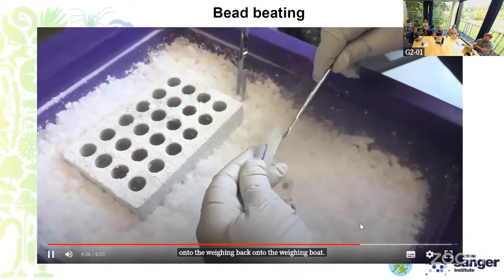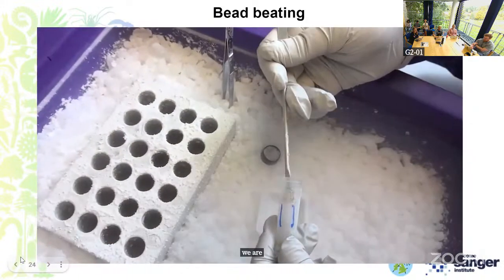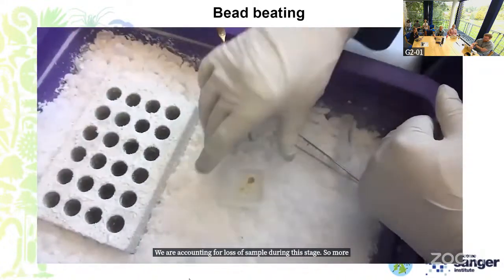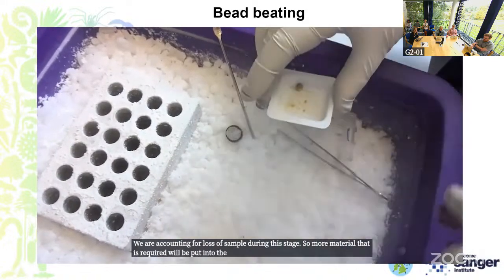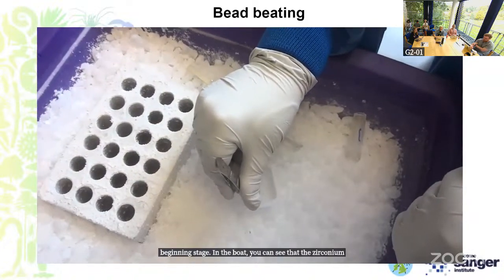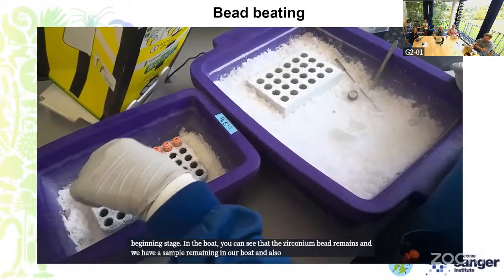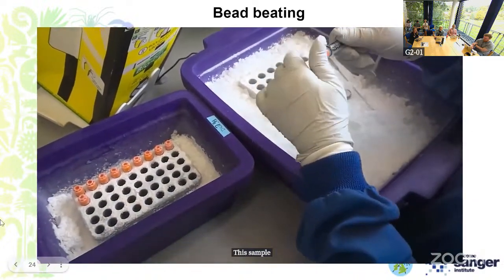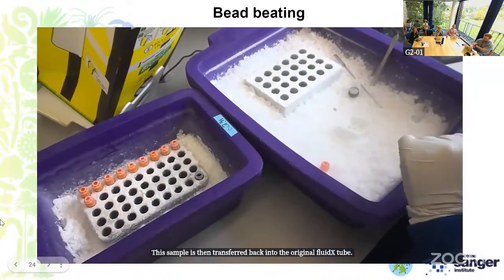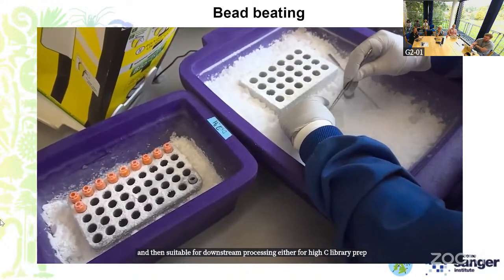Similar to what Priyanka was saying with our cryoprep, we are accounting for loss of sample during this stage. So more material than is required will be put into the tubes in the beginning stage. In the boat, you can see that the zirconium bead remains, and we have sample remaining in our boat also. This sample is then transferred back into the original fluid X tube, and then suitable for downstream processing, either for Hi-C library prep or for DNA extraction.